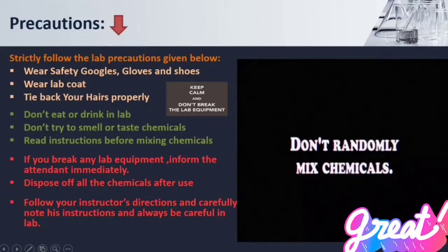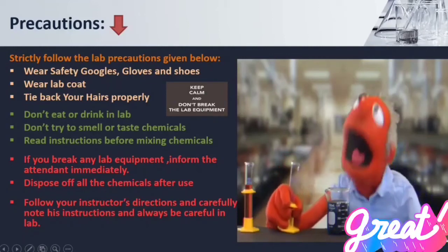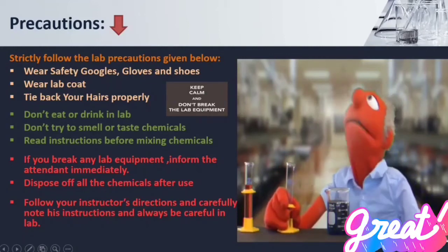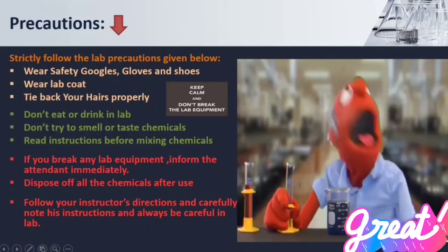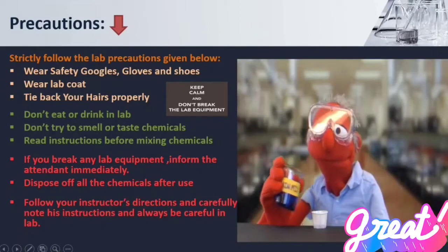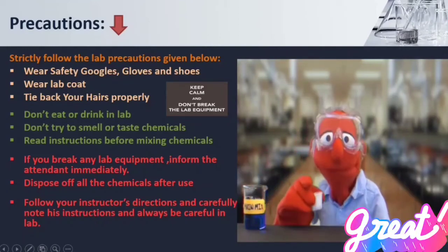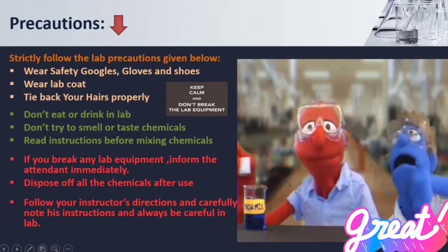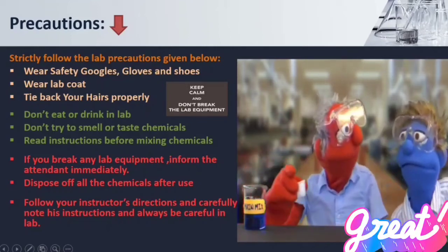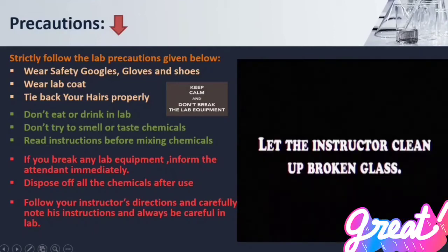Don't randomly mix things. Don't pour chemicals back into the original container. Okay, so it's a broken glass.